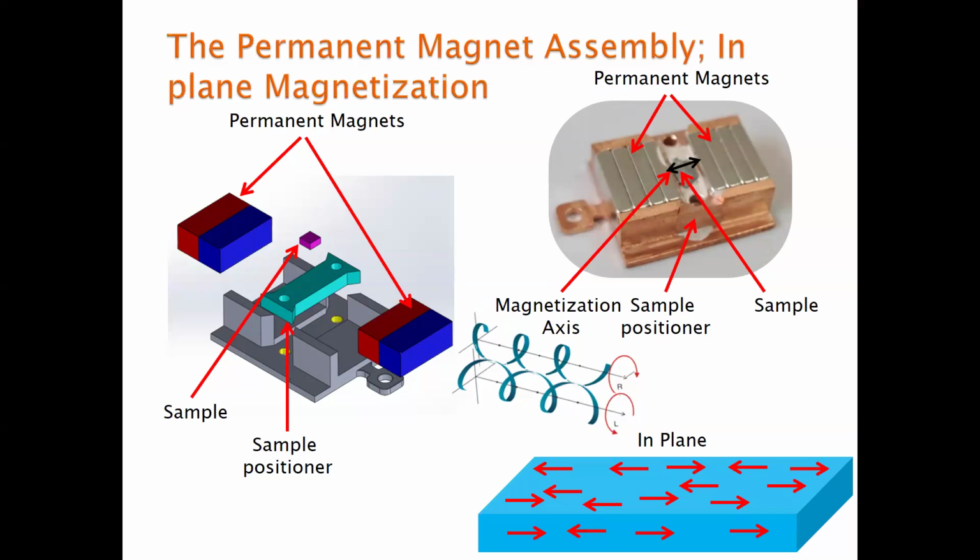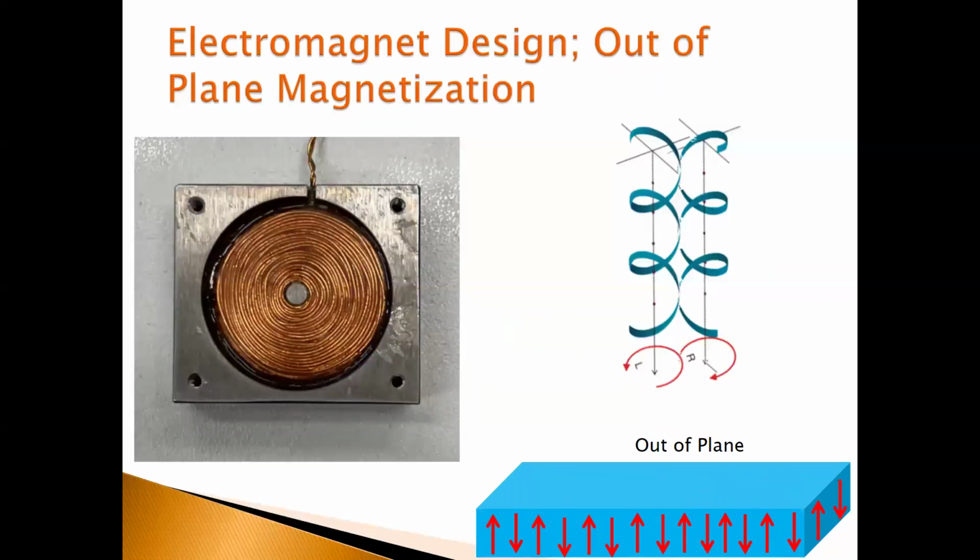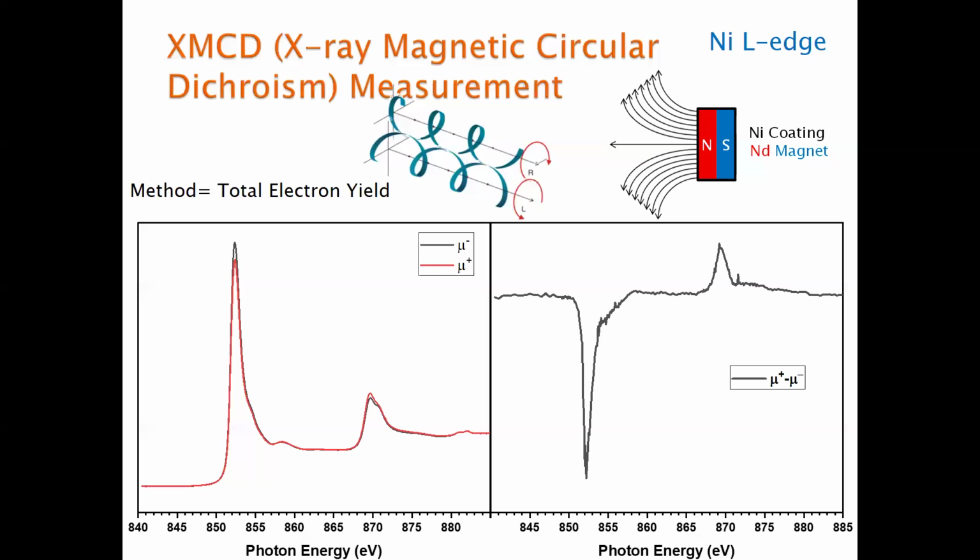Thank you very much, Dr. Mustafa, for the very interesting talk. My question was related to the spectra itself, the XMCD spectra, and the difference between the two spectra. How does one become sure? Because I see the spectra before taking the difference as qualitatively similar. I know, of course, they are not identical, but to what extent can one relate these slight differences?